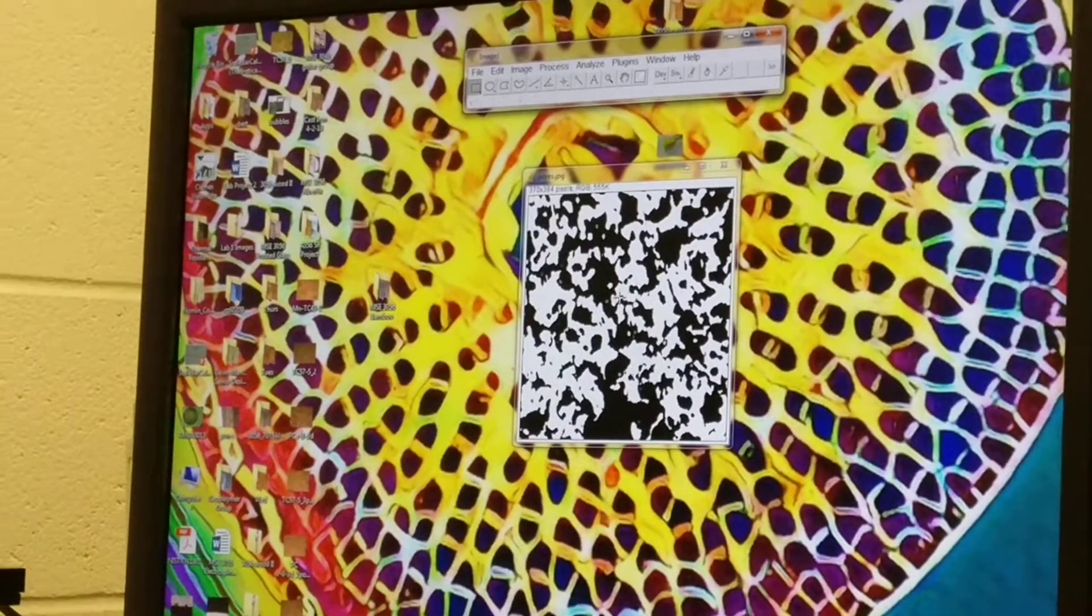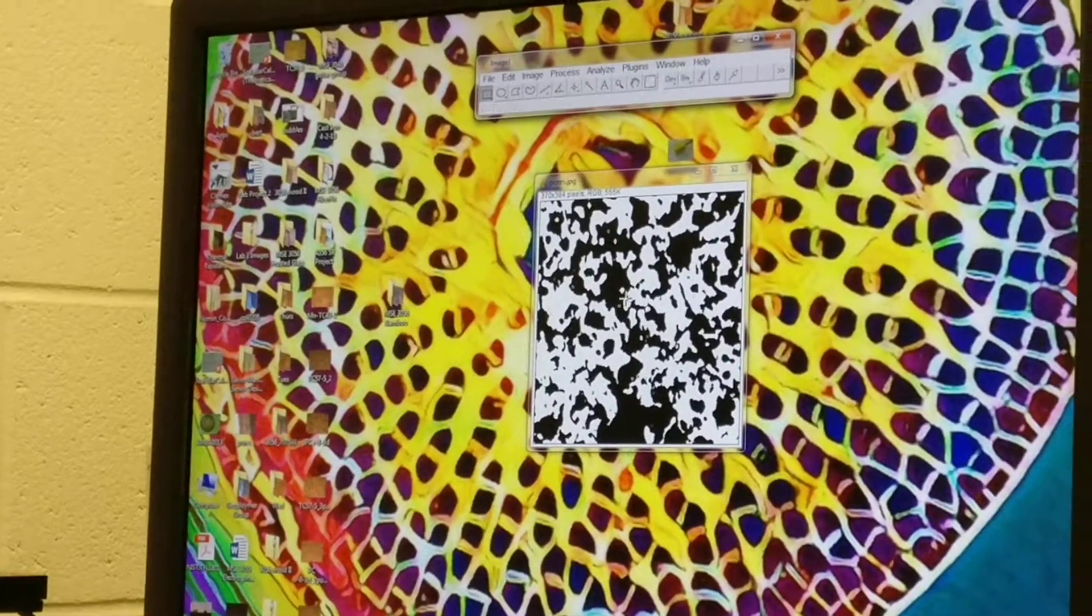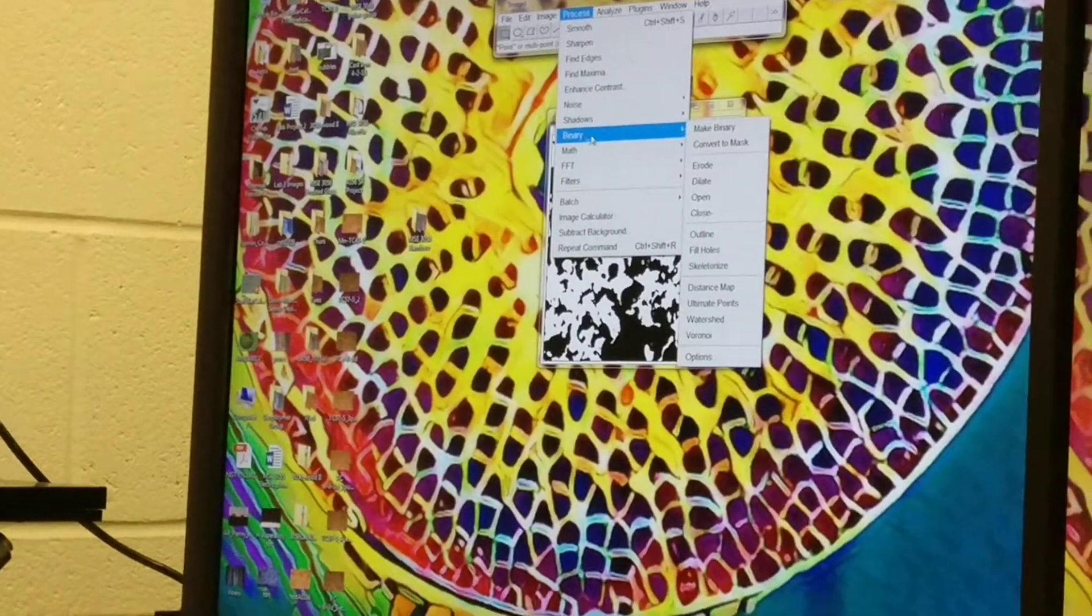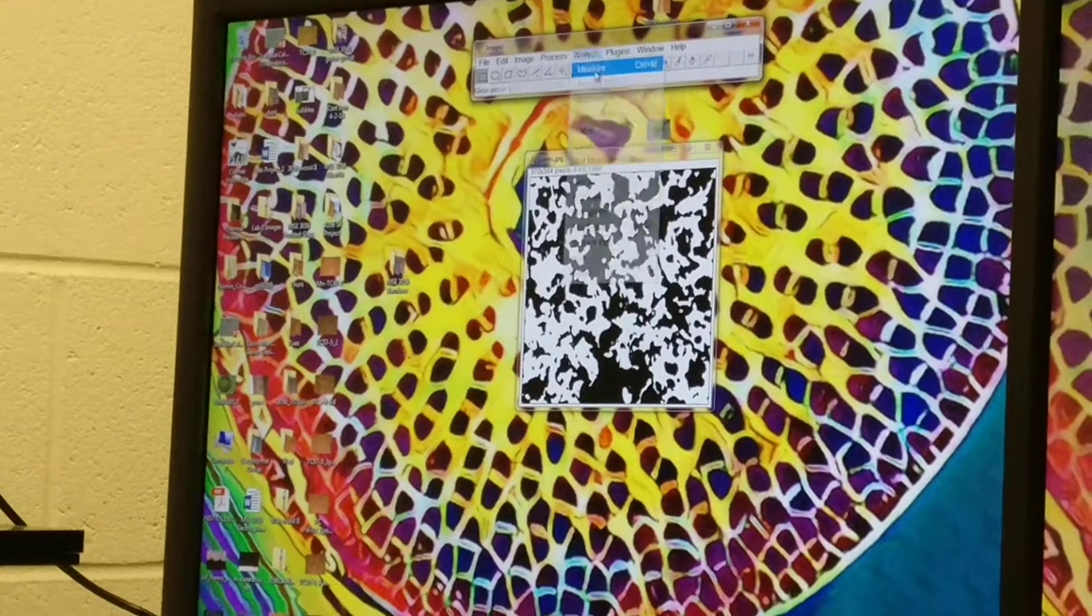The next thing we need to do is make this a binary image so that it can calculate the area of the black part. We're going to do process, binary, make binary. Then we're going to click analyze and measure.